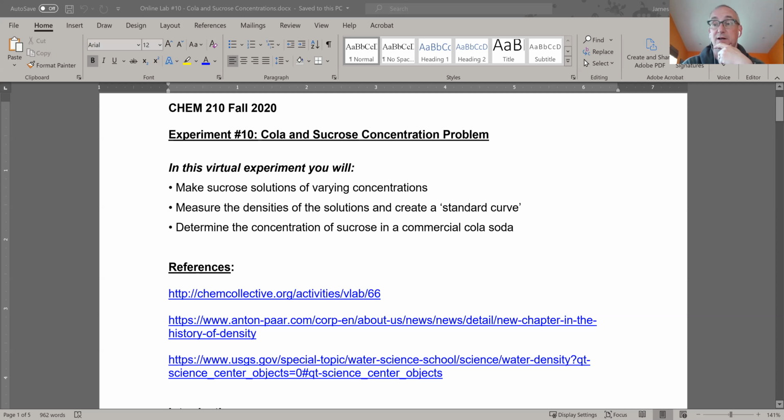Yeah, it could be density. It could be plotting density against... They're qualitative? They're not qualitative, no. Quantitative? They're quantitative, right? So you're making quantitative measurements. Those go on the y-axis. You're also taking quantitative something else going on the x-axis.